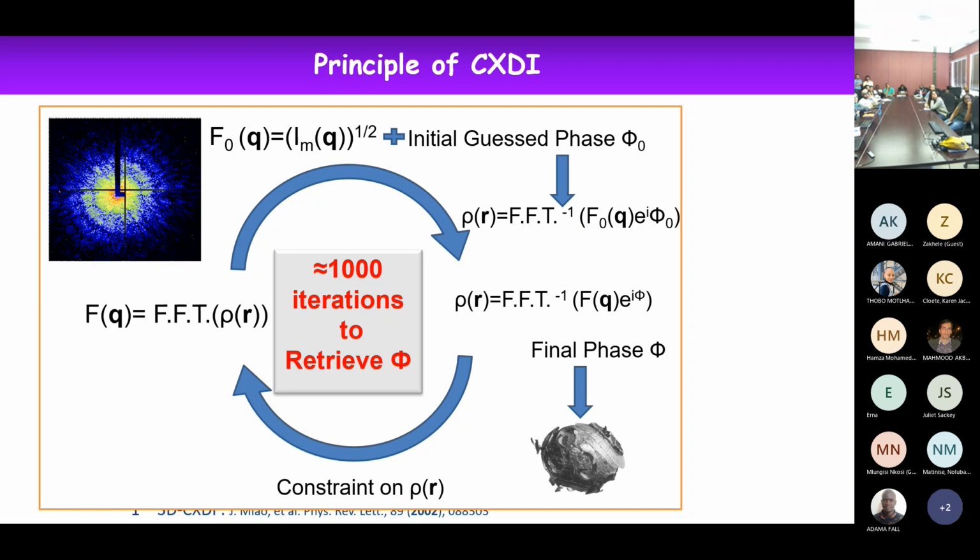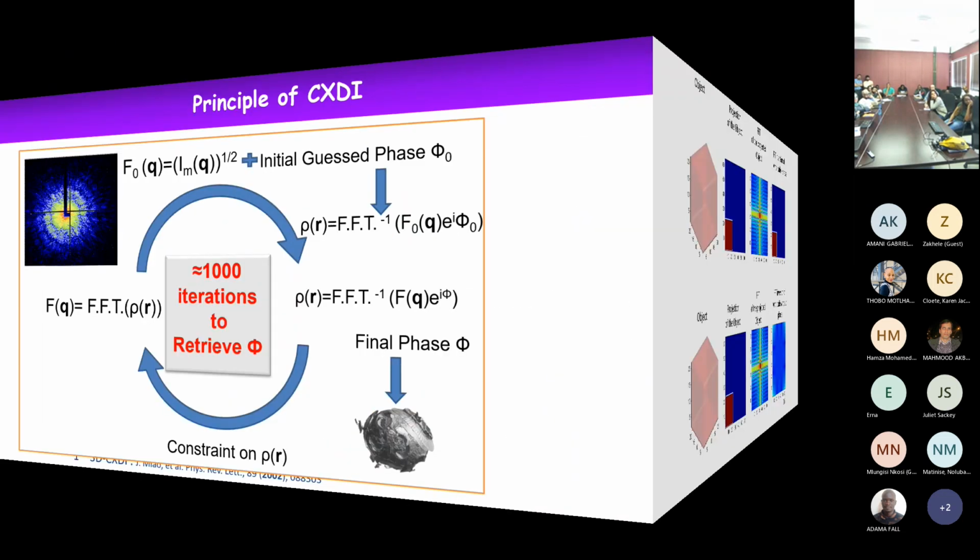So it's called the phase retrieval algorithm, which has been provided by the people at the beamline, and I didn't go through the calculation by myself, but used the program, and in the end, you can get a full description of the image of the sample.